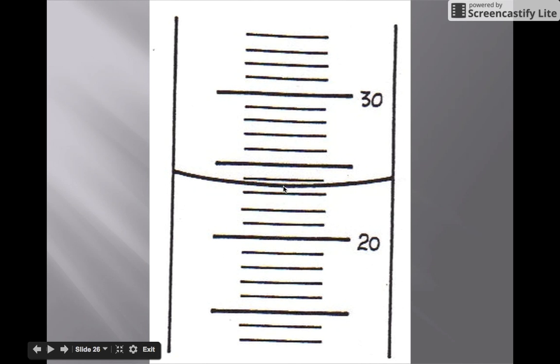So this is 23 point something. And now we're into the land of doubt again. 23.6 is my guess. Although we could probably argue that it's 23.5.